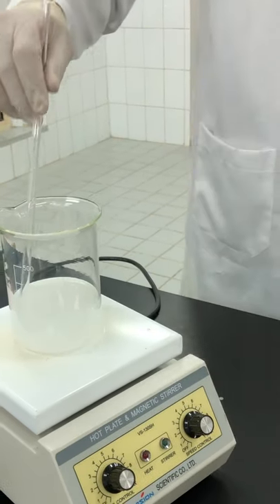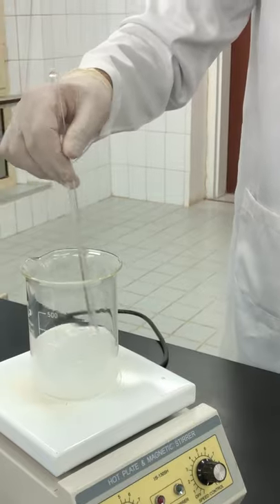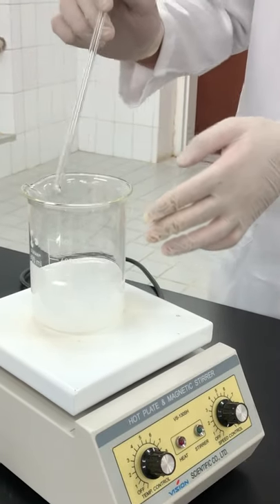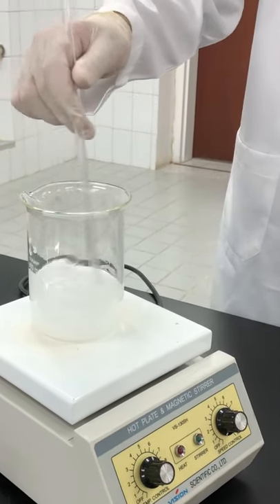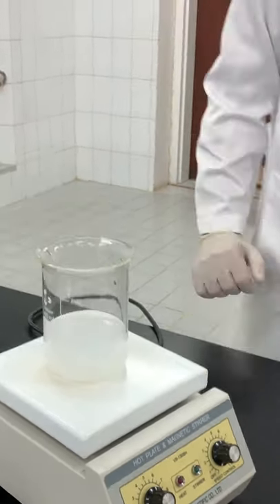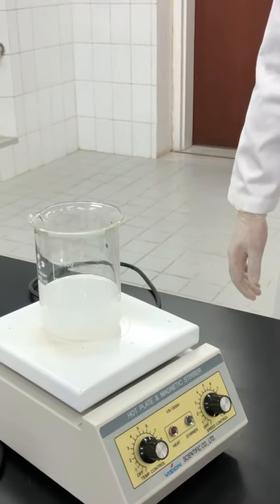It's very important to heat gently without boiling, because in the last step after 20 minutes of heating we will allow the two layers to separate completely and the precipitate to settle down. This step will be very difficult if we boil the mixture. So we'll keep it at this low temperature for about 20 minutes.